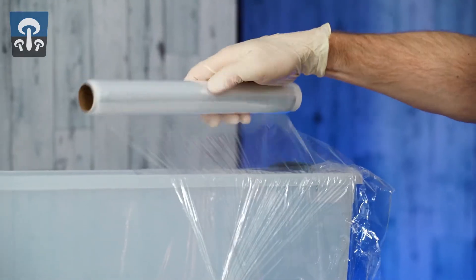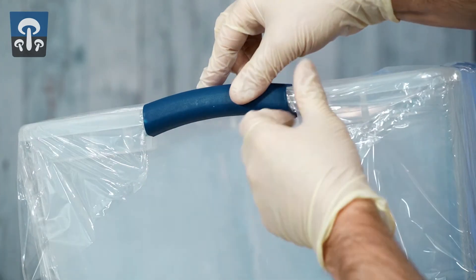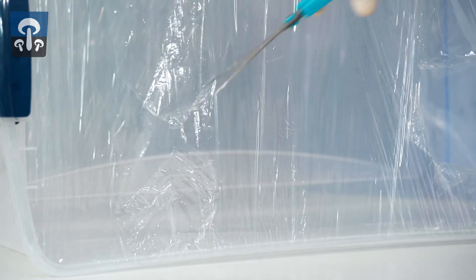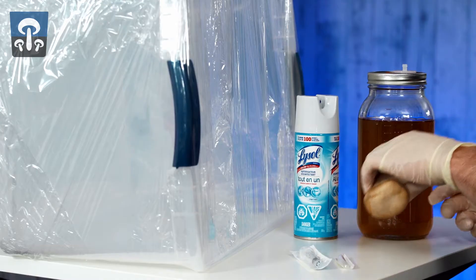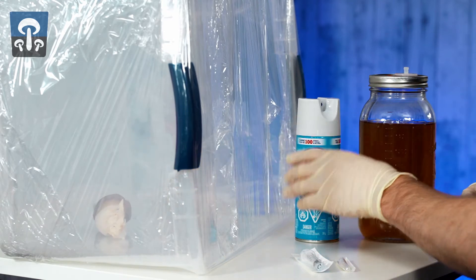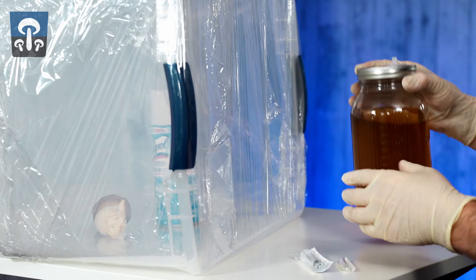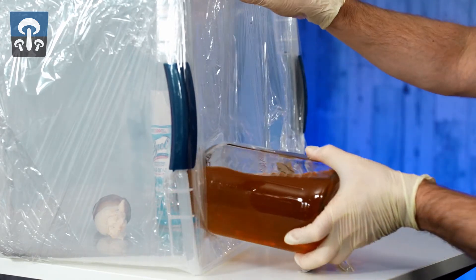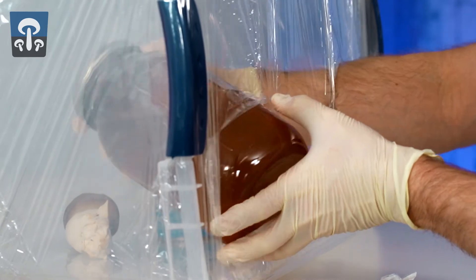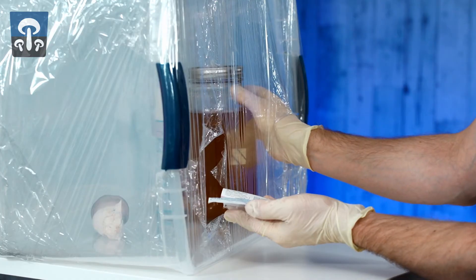We're first going to cover the bin in saran wrap and then cut arm holes to get our arms in and out. In goes the mushroom, the Lysol, the jar, and the syringe and needle tip.